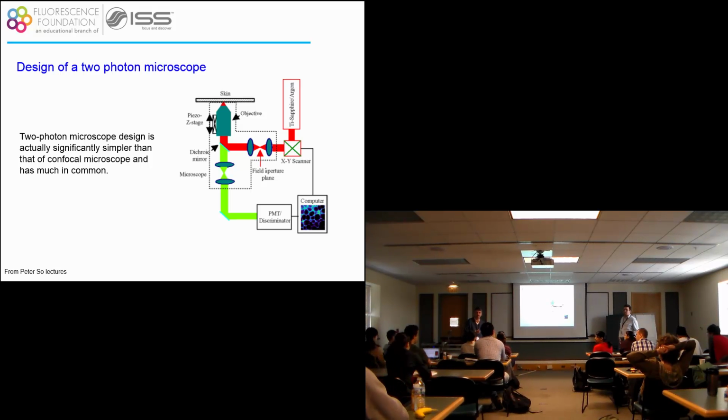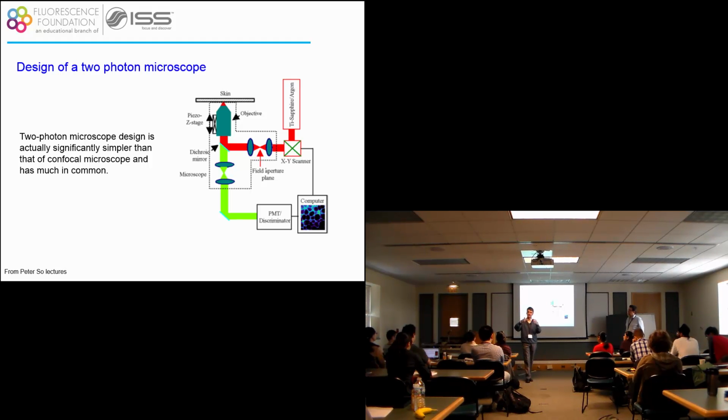Yes. Can you talk a little bit about the point spread function, roughly what it looks like? So you use light to illuminate an object, and then you collect the image of the object. The point spread function describes the general distribution in space of the light source that you use.